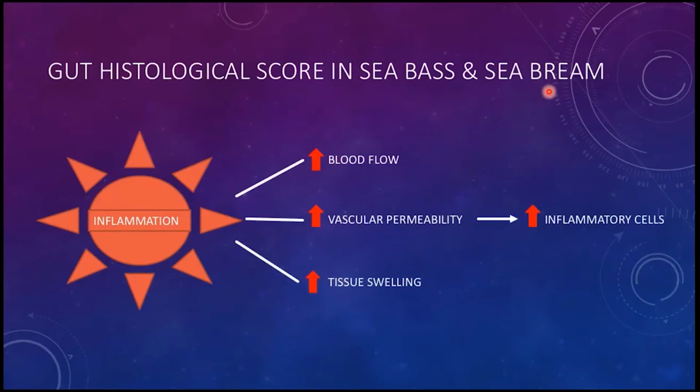Then we can move into more specific scenarios where we need to be more precise, because maybe the inflammatory response that is going on is more subtle. It's not so dramatic, so we need to be a little bit more fine in the assessment of the intestines. That would be the situation of the histological scores.